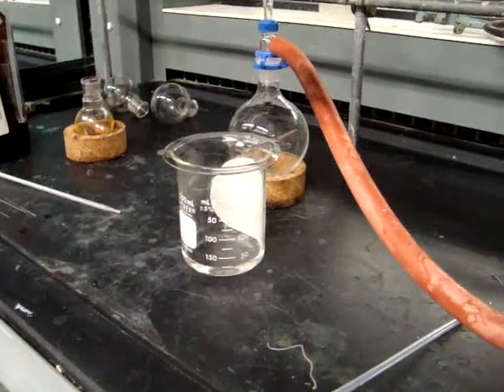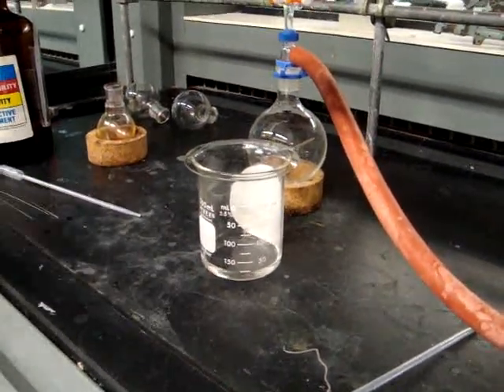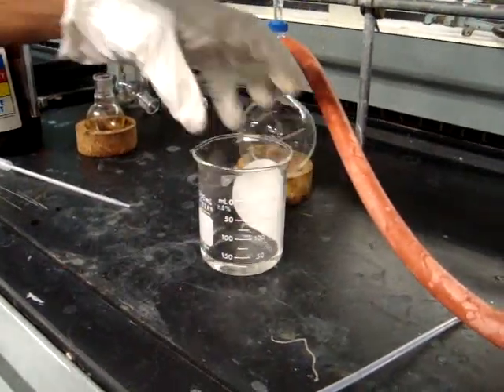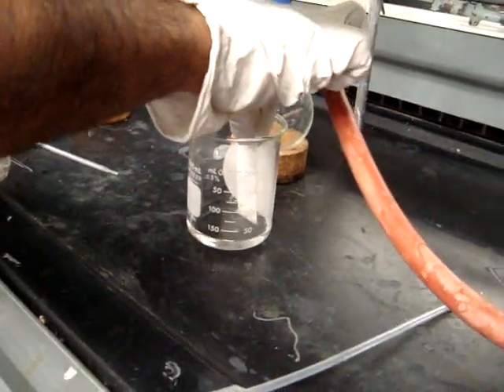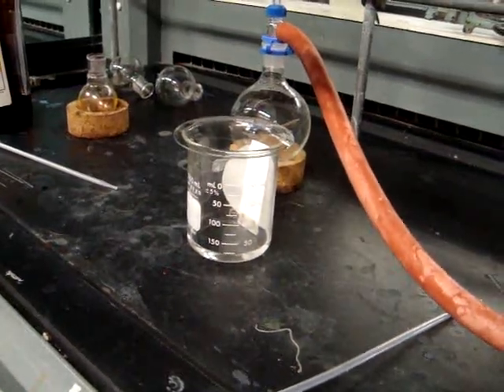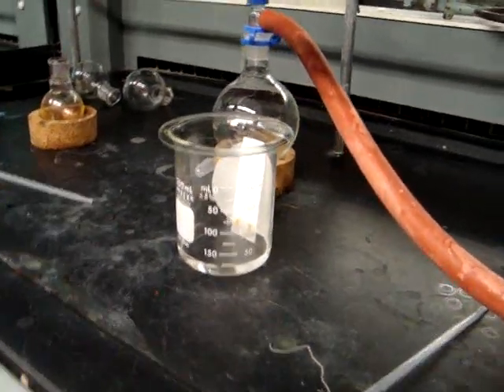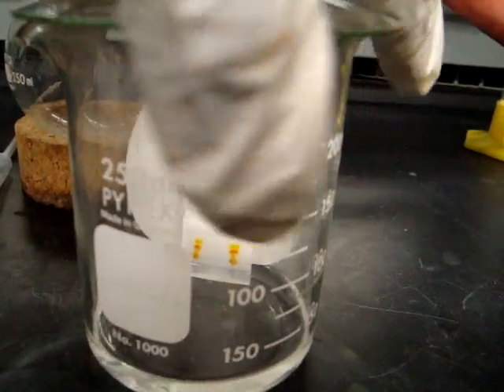You want to make sure that the filter paper is completely saturated with the watch glass on top before adding your TLC plate. To completely saturate the chamber, you need to make sure that you're swirling the solvent system in the beaker. You will then add your TLC plate into the TLC chamber, making sure that the baseline is above the solvent system. You will then wait as the solvent front rises up the TLC plate to the top of the solvent front.